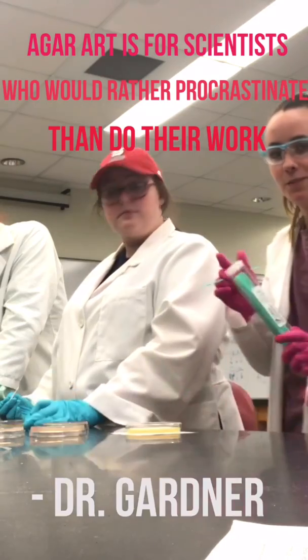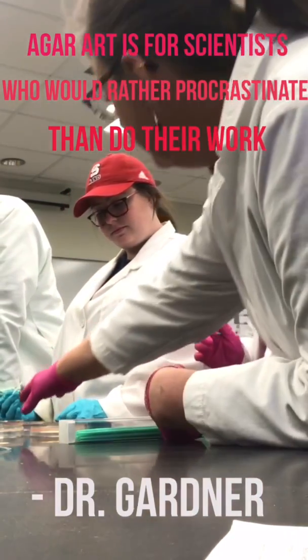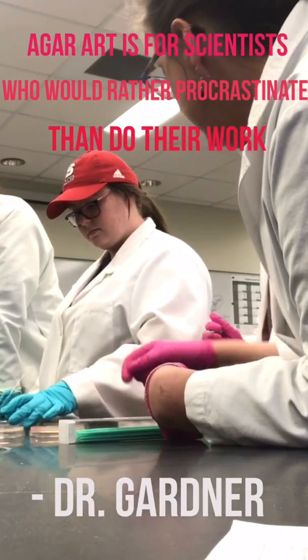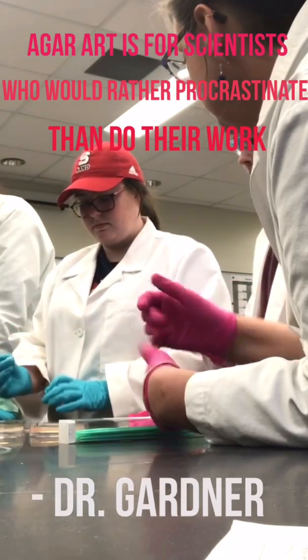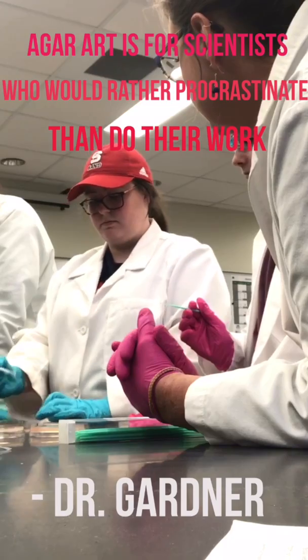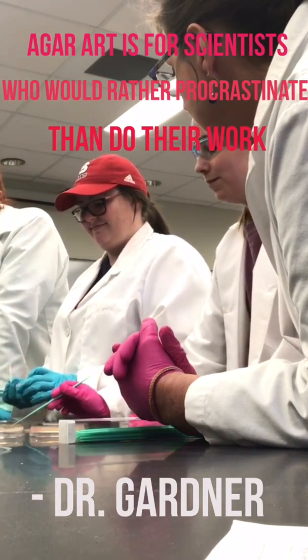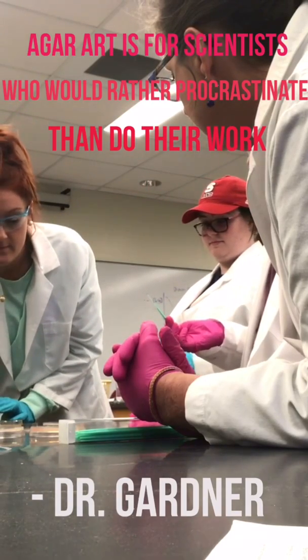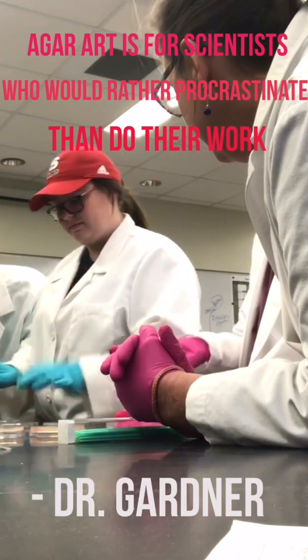All right, instruct us. Okay, so what you're going to do is grab a little bit of cells from the Serratia plate. So you can just take the lid off, and you're going to get a little bit on your loop. You can get a nice big chunk. There you go. And then you just take the lid off your plate.